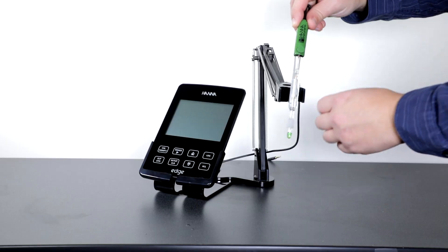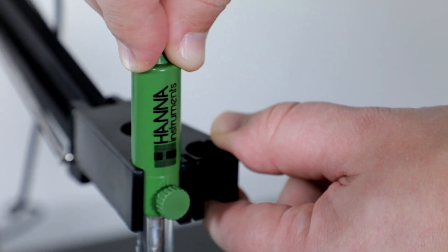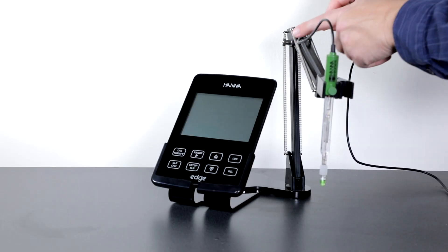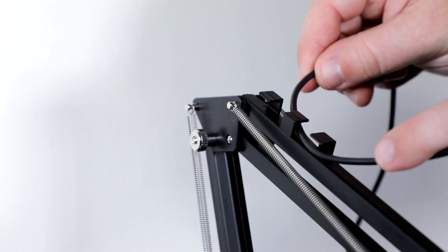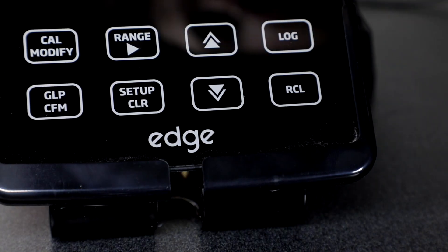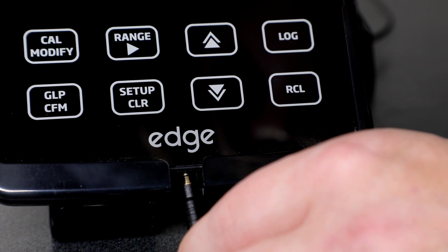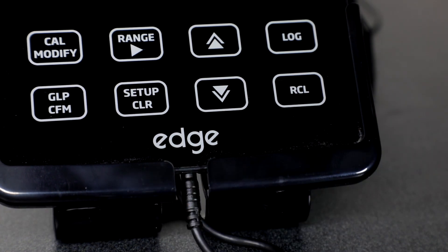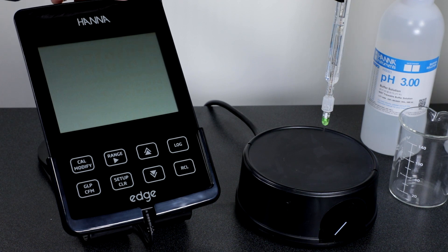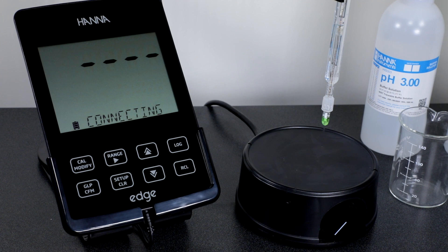The next step in assembly is to place the electrode and plug it into the meter. Insert the electrode into one of the slots in the holder and press down until it's securely in place. Run the wire up through the slots and bring the plug behind the meter, then pull the plug through the opening in the bottom of the assembly and plug it in. Finally, plug in the power supply and turn the meter on.